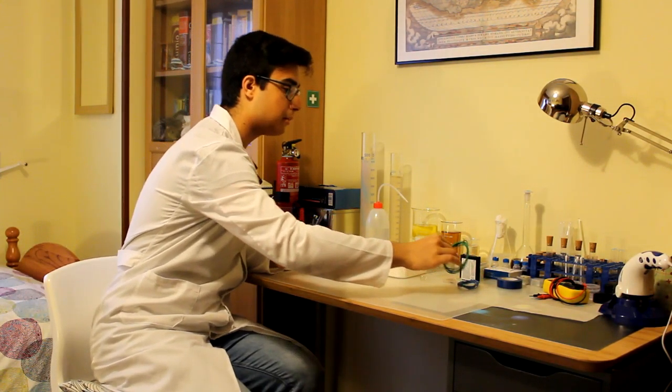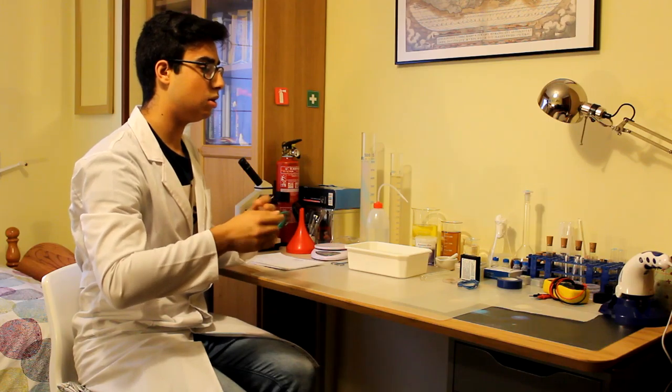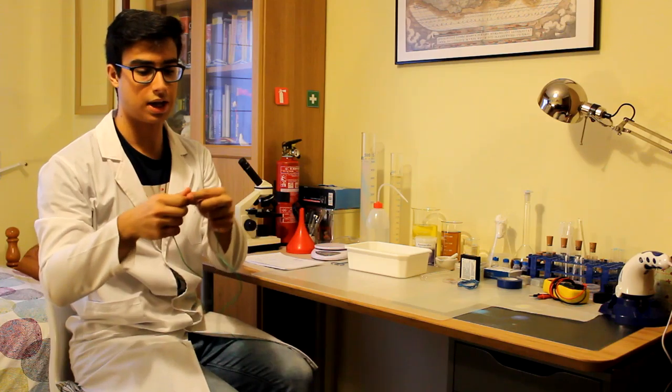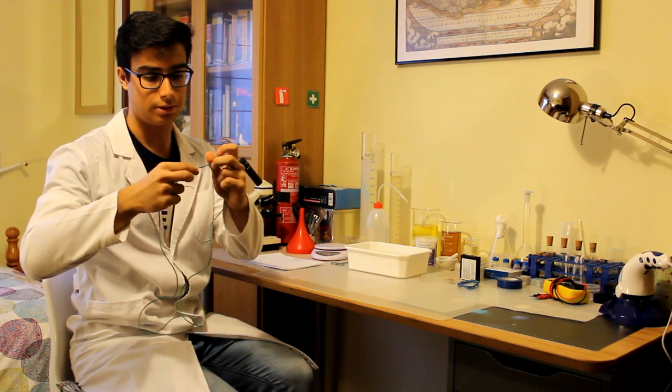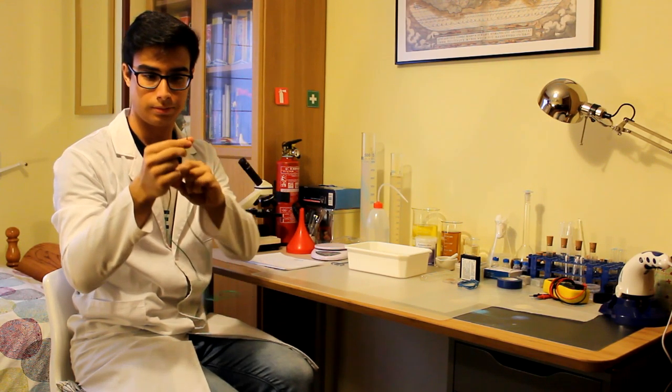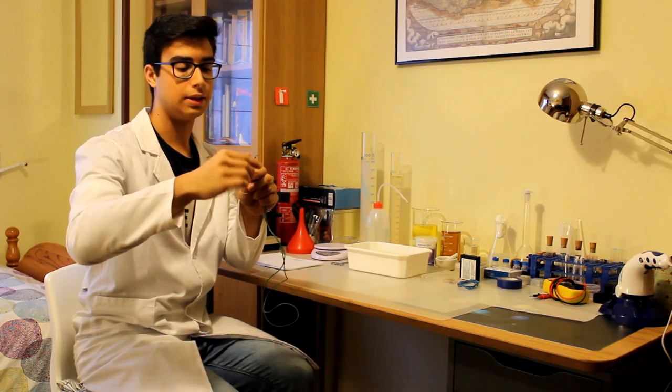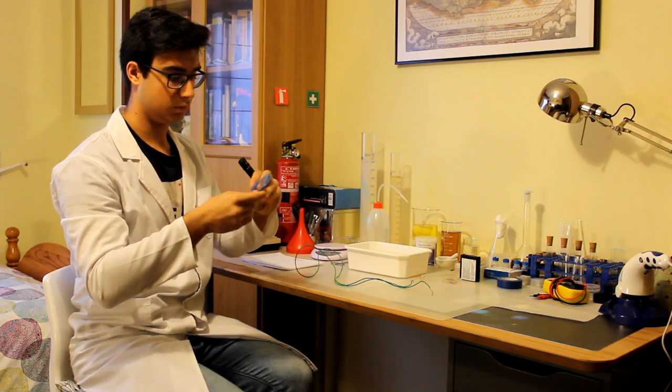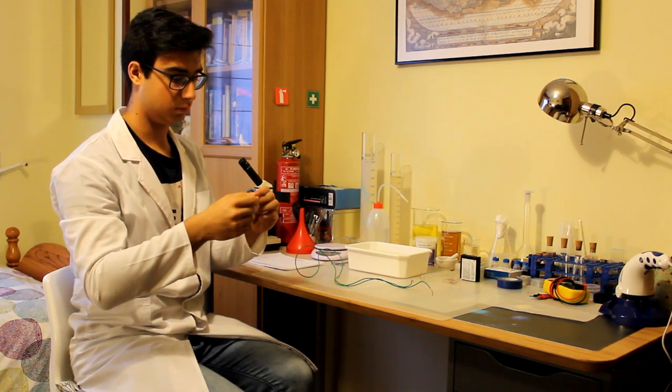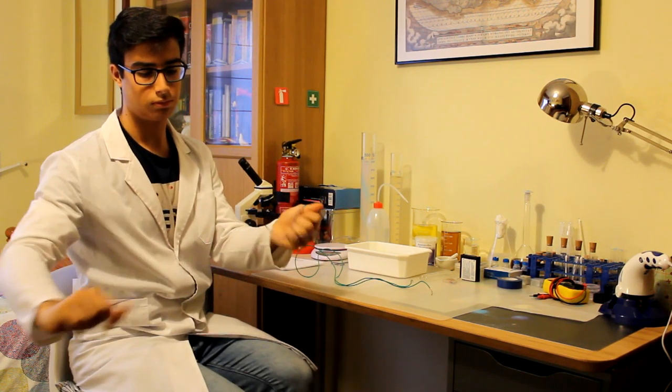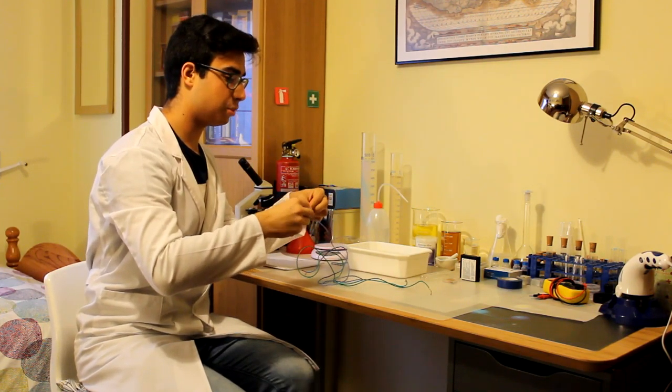Vamos allá. Lo primero que tenemos que hacer es preparar los electrodos que van a estar sumergidos en el agua. Para eso, cogemos dos trozos de cable, le pelamos las puntas. Si no sabéis cómo se hace, pedidle ayuda a un adulto. Dejamos bastante trozo de cable descubierto.